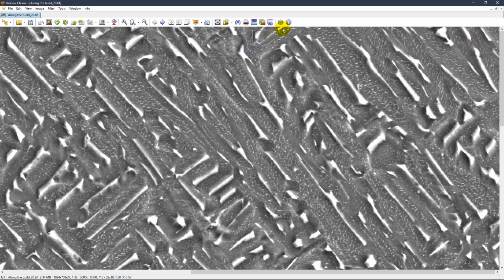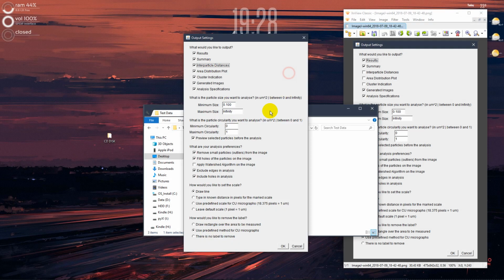Like for example, here we cannot see the full particle, maybe it goes somewhere beyond the image, and analyzing just part of it can give some false results of the overall look of the micrograph structure. So it's also worth leaving that option.